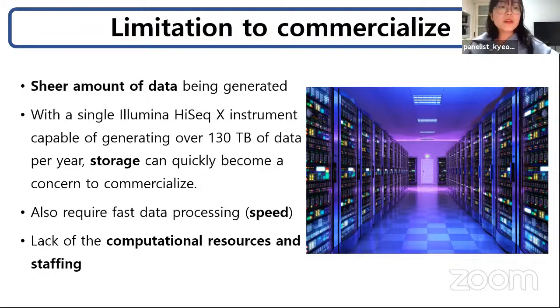And a single Illumina high-throughput sequencing instrument is capable of generating 130 terabytes of data per year. So the storage can quickly become a concern to commercialize.